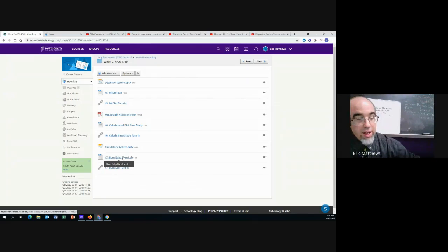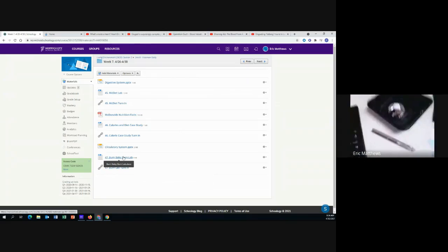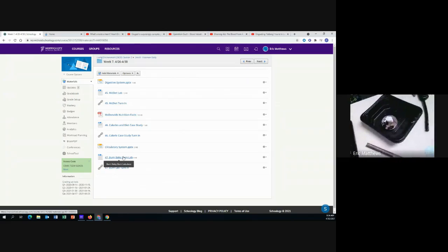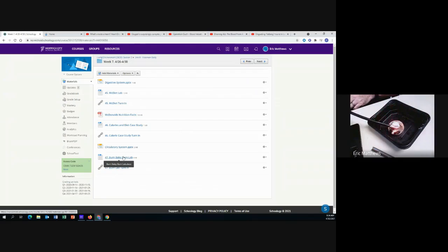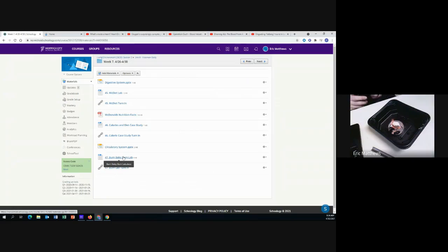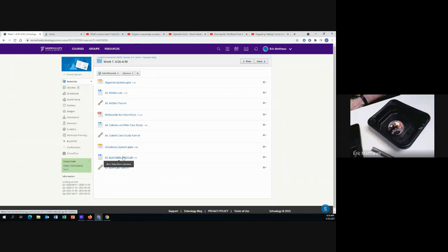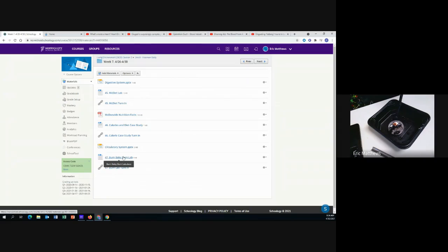Now this one, we'll see how it goes. I got the marshmallow on there. If you've ever cooked a marshmallow before, you kind of know how this one's going to work. Counting: one, two, three... thirteen, and that one kind of failed. Look, there's this whole area here that is not cooked.